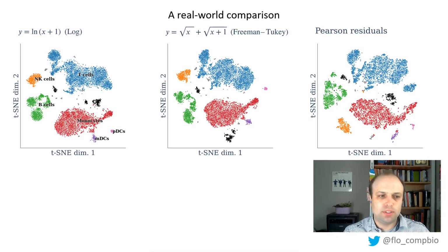There are some modifications that have been proposed where you do some clipping because it can get really extreme. For example, I think in this data set there is a contamination with red blood cells. I think it's only a handful of red blood cells, but because they have such a unique expression profile and because they're so rare, they become one of the dominant sources of variation if you just calculate the pure Pearson residuals, because the evidence that these hemoglobin genes are non-uniformly expressed is so overwhelming compared to any other gene that it just completely drives the variance in that direction.